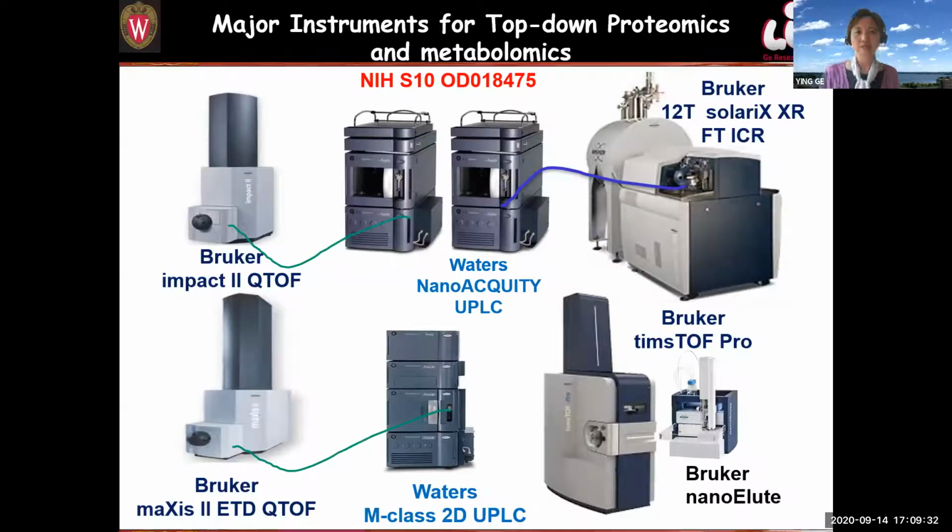These are the major instruments that we acquired recently, and that's the workhorse for our proteomics and metabolomics efforts. And we want to thank the NIH S10 grant for the purchase of these instruments.